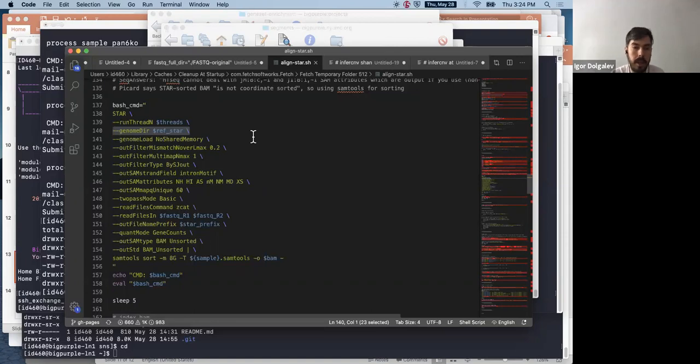And so over time you start to add all these various other parameters just to make sure that the BAM file that you get is actually compatible with all these other tools that you might want to use later. And this part, although technically it's documented somewhere, is sort of trying to figure out how all the different tools work with each other. It is a little bit of trial and error over a long period of time.